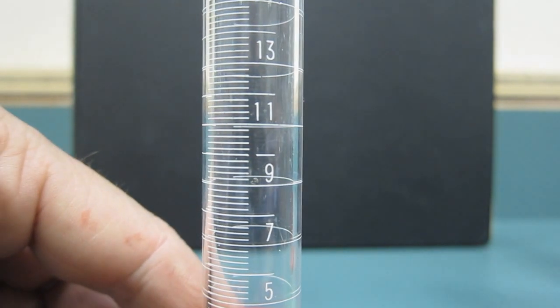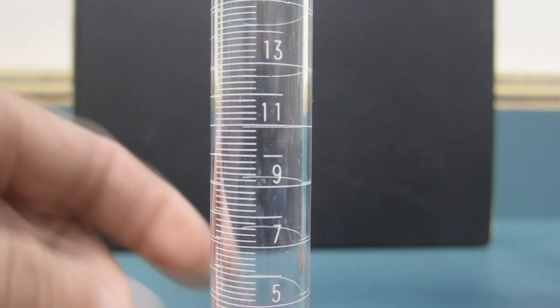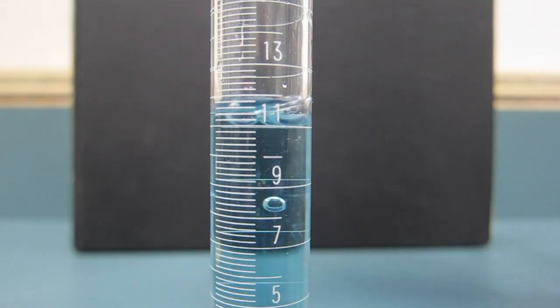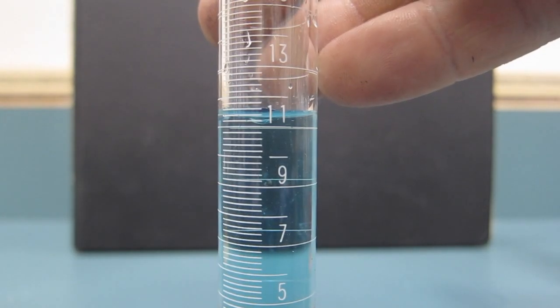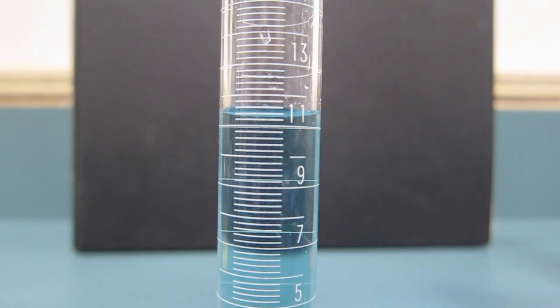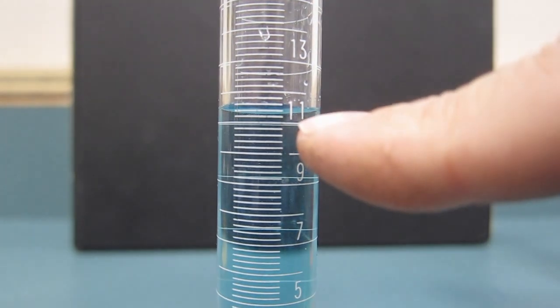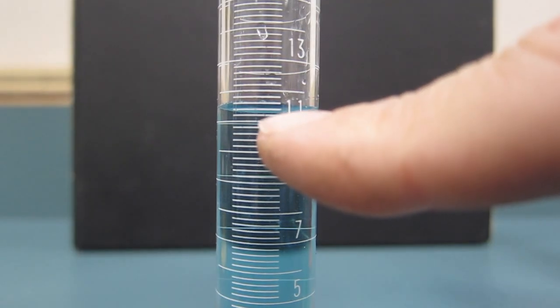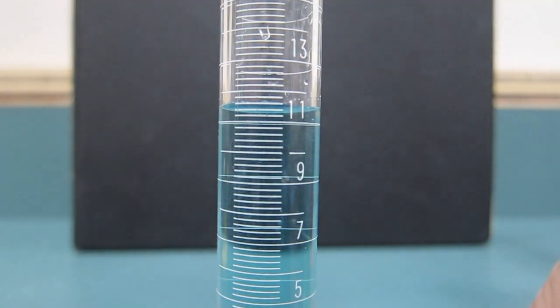So if I pour in some liquid here, again, this is the 25 milliliter one, but it's the more accurate, skinnier one. Let's see what we got right here. It looks like here's my 11 mark. Here's my 11.2, 11.4. I'm about 11.2, maybe slightly above that. So that's that one.